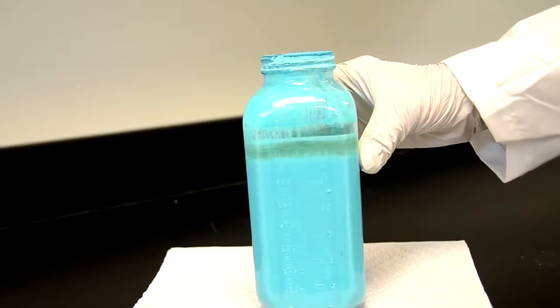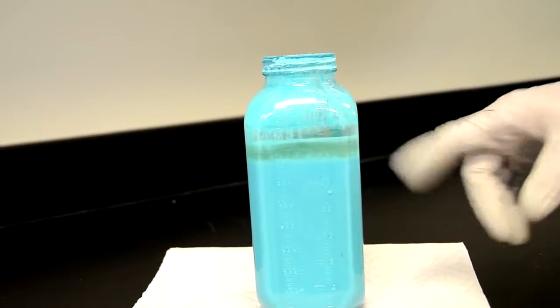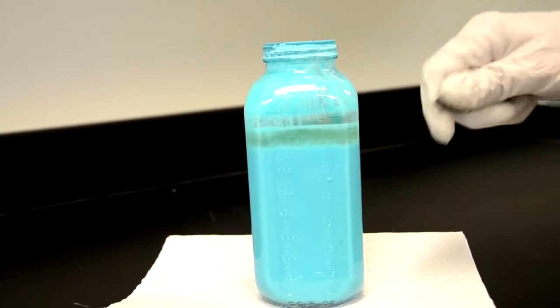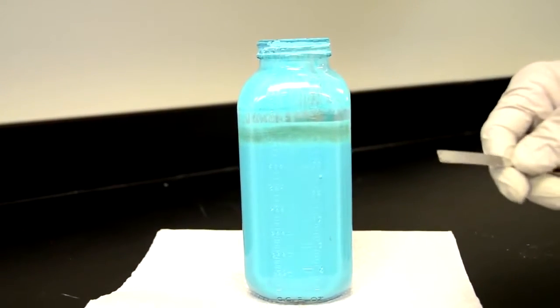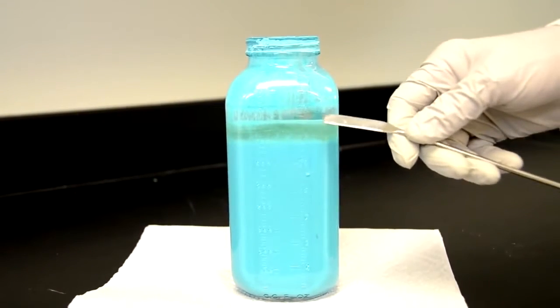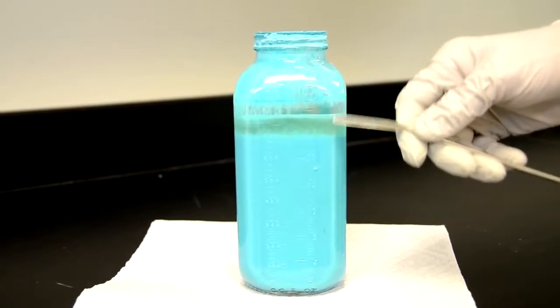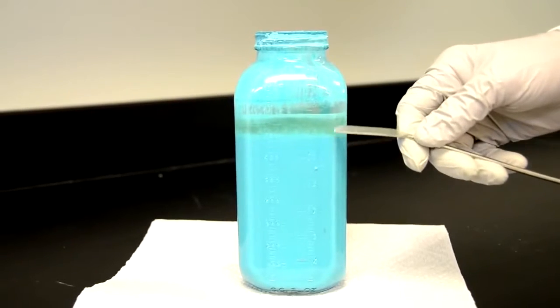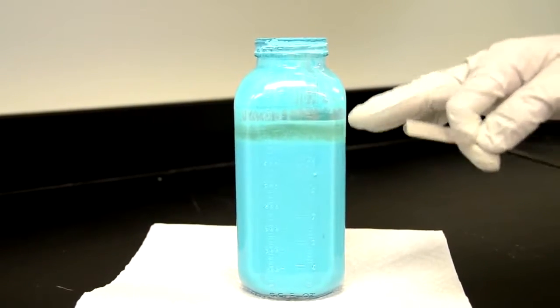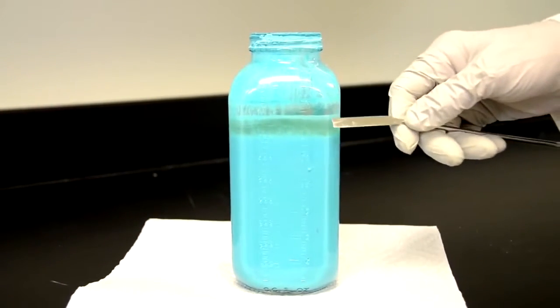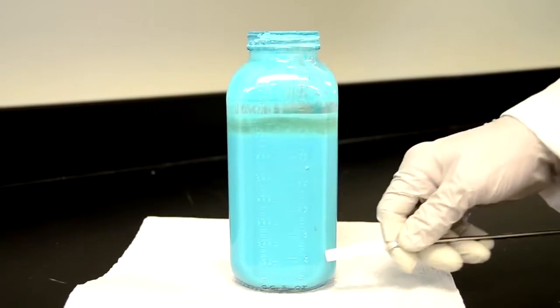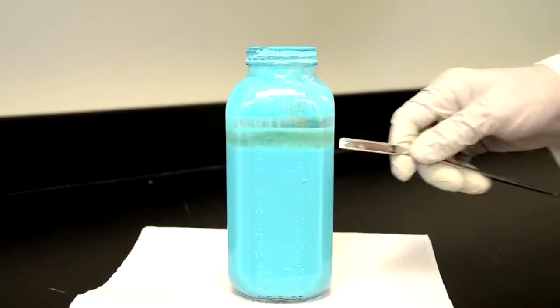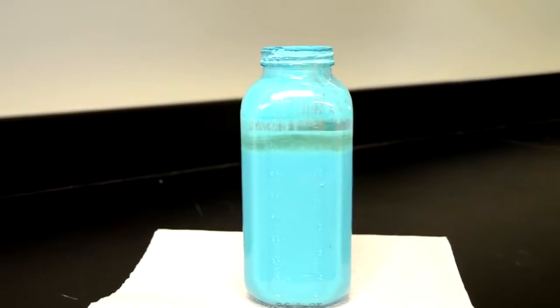What we have here is a sample of our competitive product. Some of the deficiencies that we noted in this formulation are first of all there's top clearing or top separation. That by itself is not a problem but it is a warning sign that the product is starting to settle to the bottom. This product has been sitting here in the lab for quite a while.